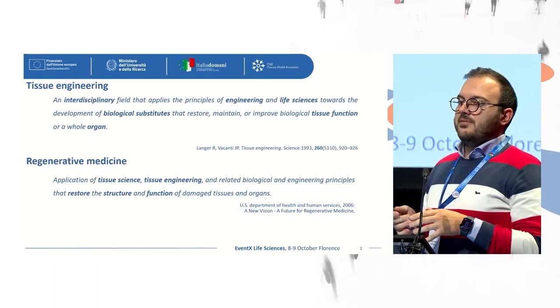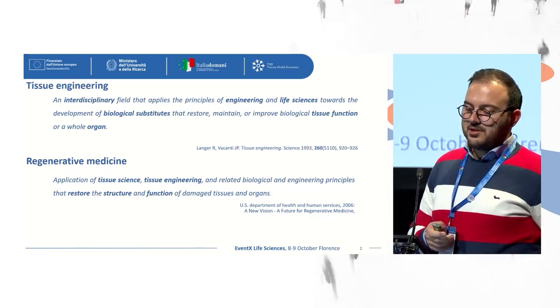So today I will try to give you a brief overview of what bioprinting is and how it can be used for the fabrication of in vitro models, also with some highlights on what we do at the University of Pisa. So first of all, bioprinting is part of the bigger research field of tissue engineering.